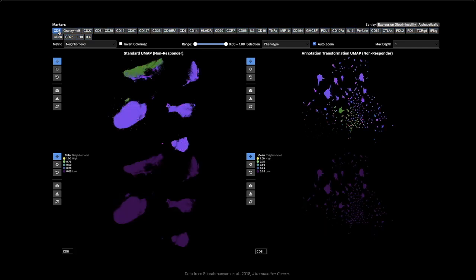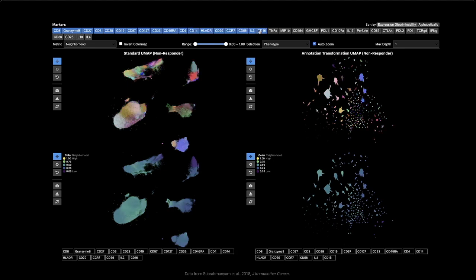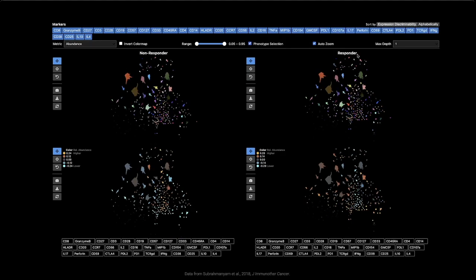We see that with just a single marker, the neighborhoods are quite similar. However, again, as we add more markers, the neighborhoods become more dissimilar. This denotes greater variability in the local neighborhood composition for each label as we add more markers and have more high-resolution phenotypes.